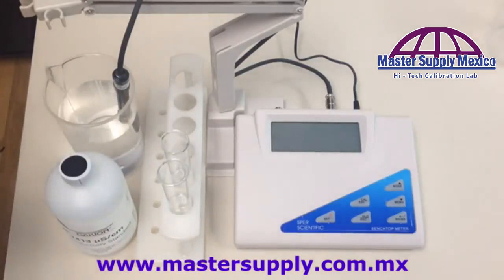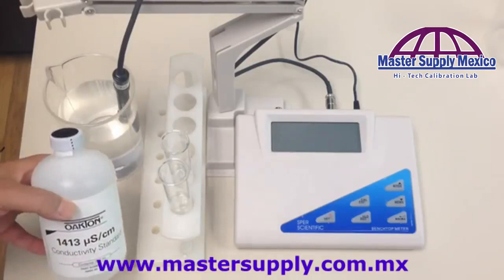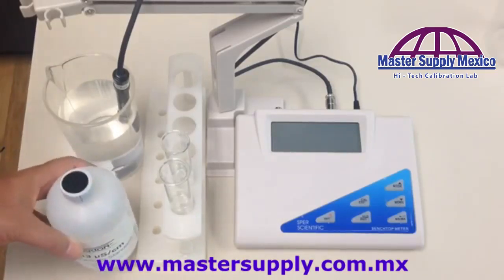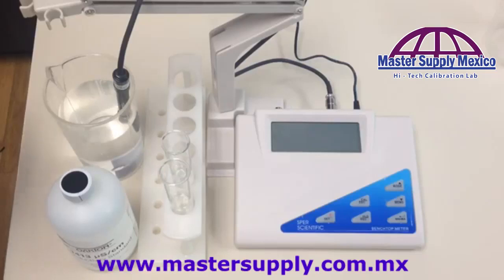This unit does five different ranges, found on page 31 of your manual. Today we're going to be doing Range 3, so the calibration solution we're going to use is 1413. That's important information to know. We are also using the two-beaker method as recommended in the manual.